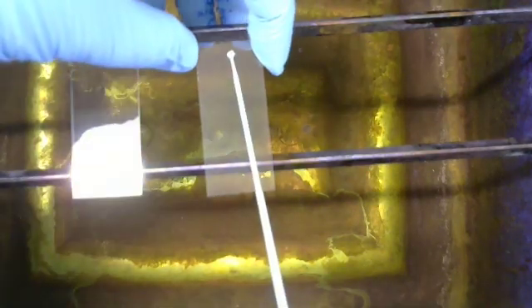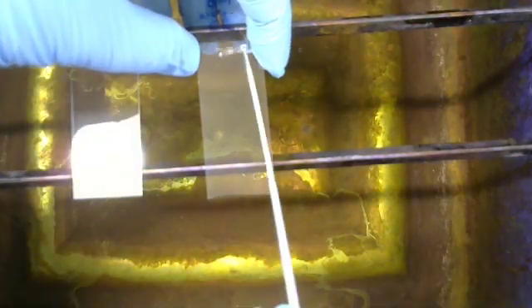And what we're going to start off with is a sterile inoculating loop, or in our case, a disposable one. And we are going to transfer a small amount of our bacteria to the slide. And this is Bacillus megaterium. We're going to start with that. And then our Kocuria.